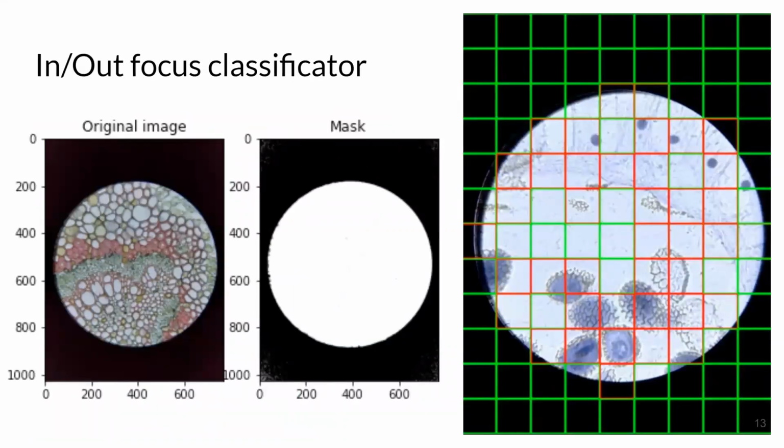We use OpenCV for extracting the background of our images, and after that we worked only with images of biological items. Our model works with 84 by 84 pixel images, but those are small pieces of the source image.